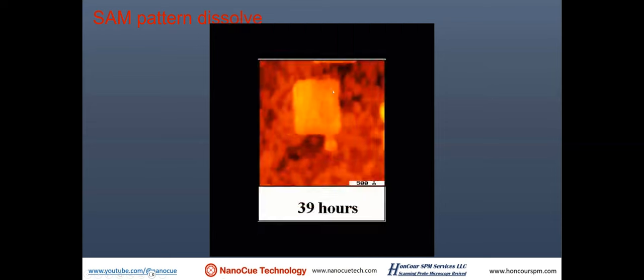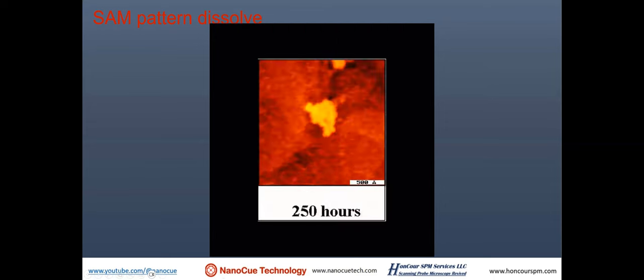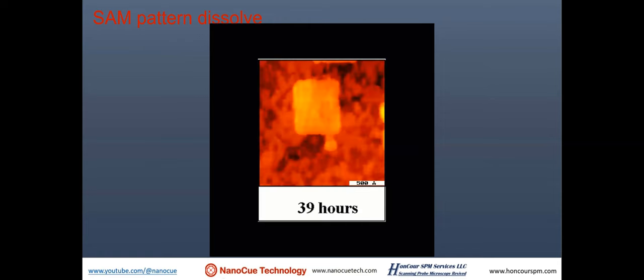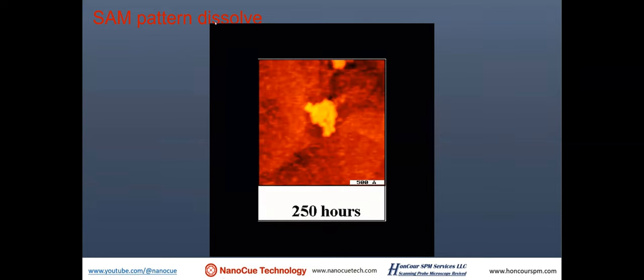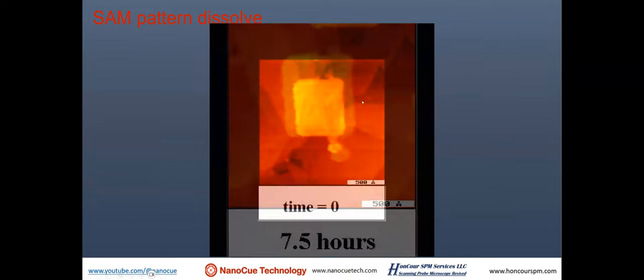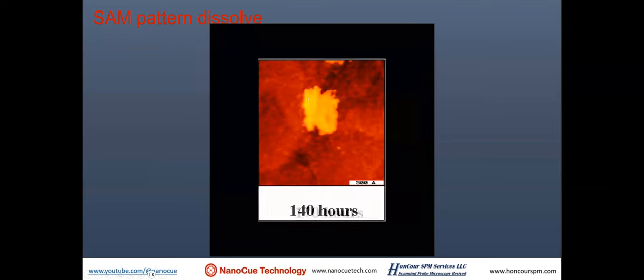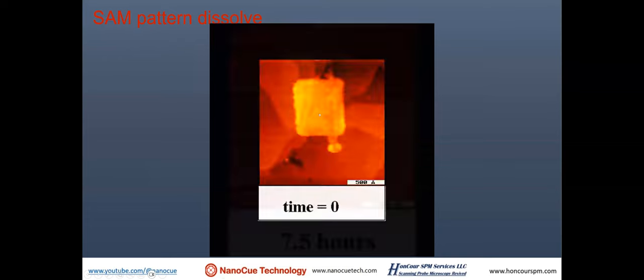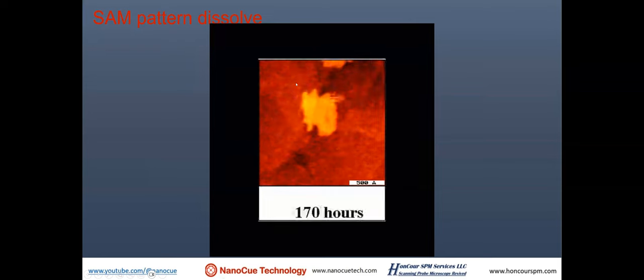And this image is obtained in ethanol, and then I used an IV to drip ethanol into the liquid cell, because ethanol will gradually, slowly evaporate. And as the time progresses, you can see the self-assembled monolayer started to break down and dissolve. And this self-assembled monolayer made using nanografting is actually dissolved last because it's generally a much higher density self-assembled monolayer.